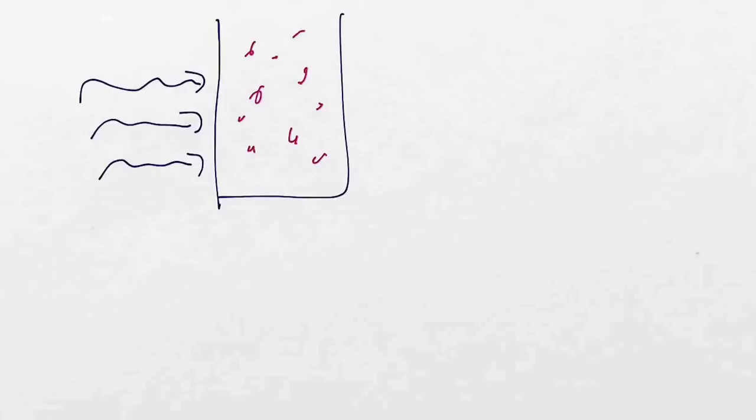So, like I showed you with Ioannis earlier, if the energy is not right, there is no absorbance. So with blue light, for example, there's no absorbance. The stuff doesn't react.